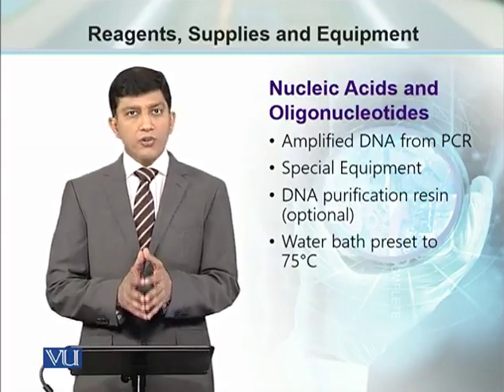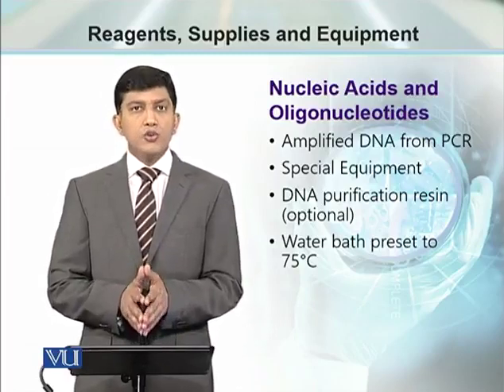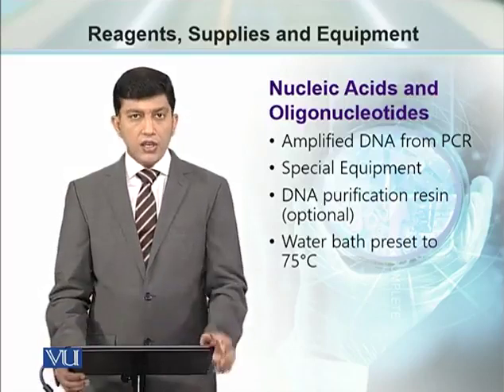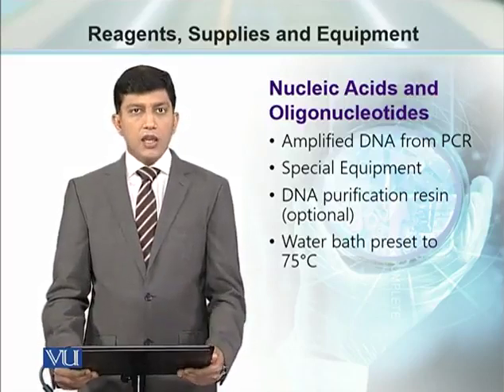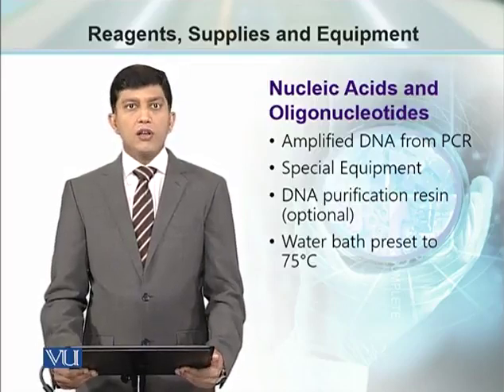So if required for purification, the DNA resin can also be used during this purification process, and we need a water bath at 75 degrees centigrade for incubation at this particular temperature.